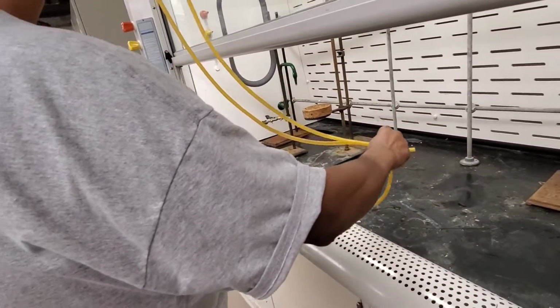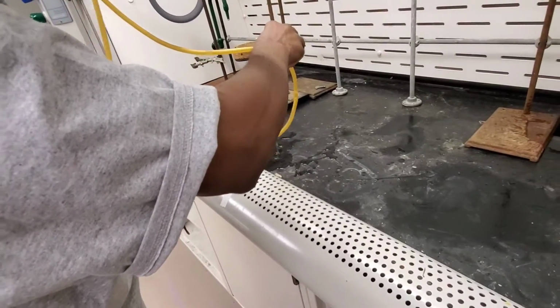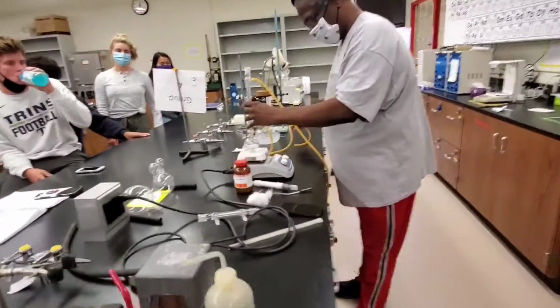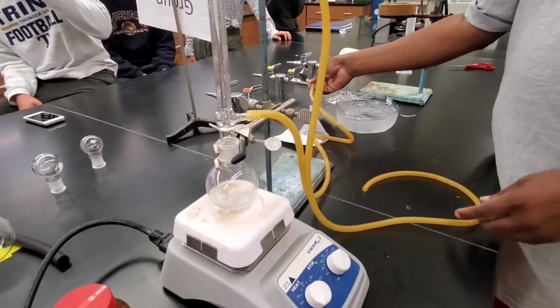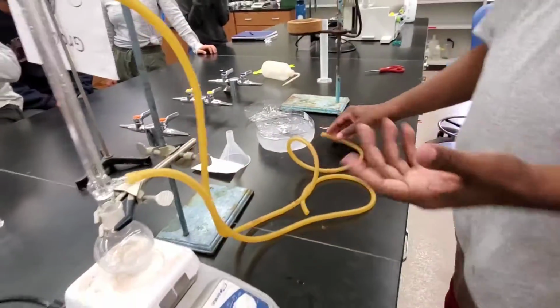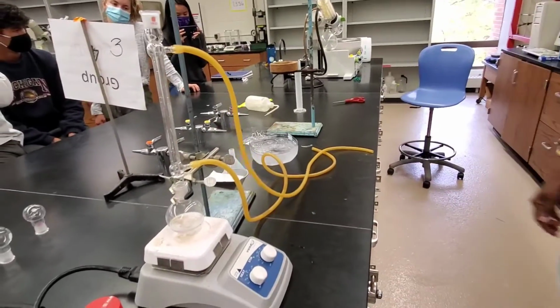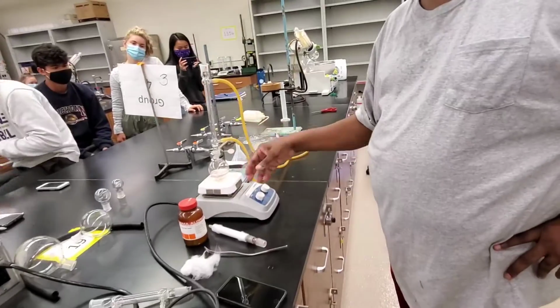So let's bring this out. Okay, so just imagine that this is hooked up to your water. These are not water in here. So just imagine they're hooked up to the water. This one is flowing out into the sink. And so at this point you will start heating the reaction.